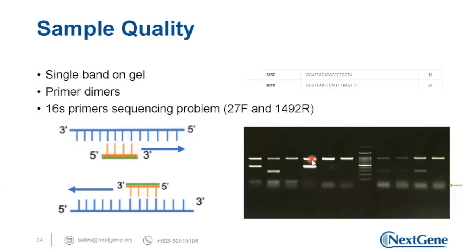So instead of just using one gel slice, if the well is not big enough, we try to see whether we can load both reactions into the same column. However, there is a risk when we do this because we don't know whether the membrane can handle so much gel or not.